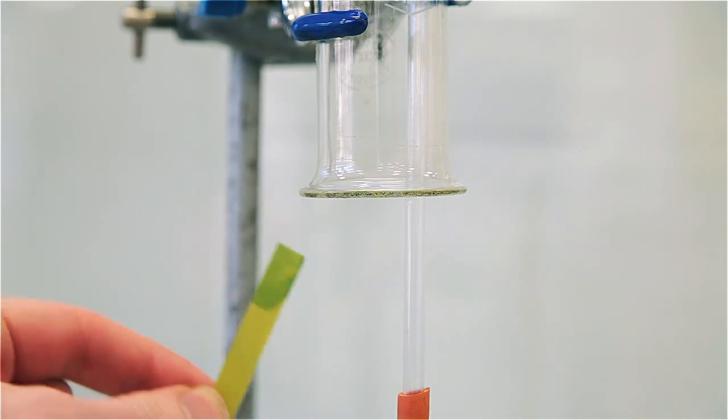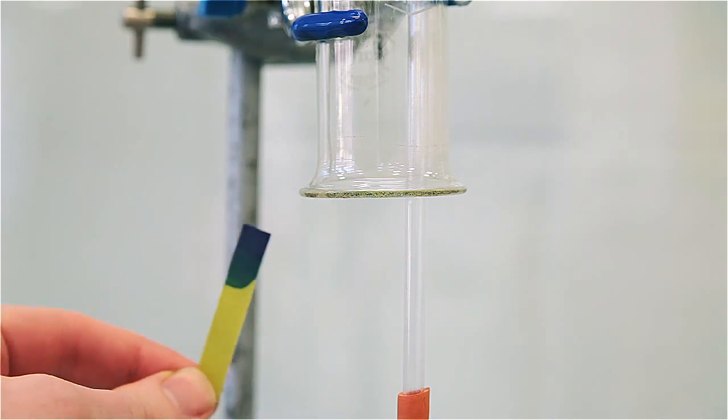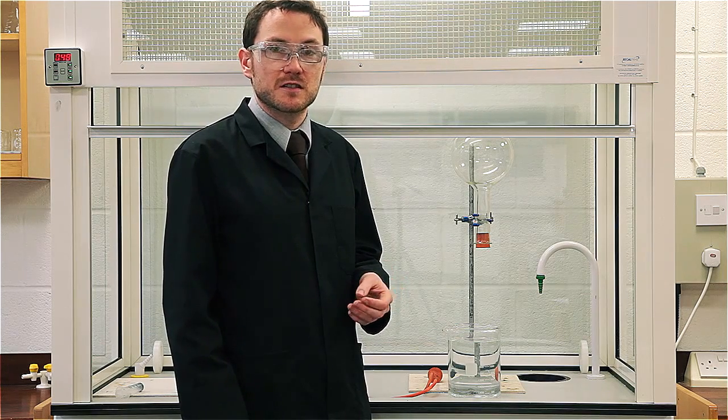If you want to check whether your flask has been filled, you can moisten some indicator paper and hold it at the edge of the neck — you should notice that it will go immediately blue.